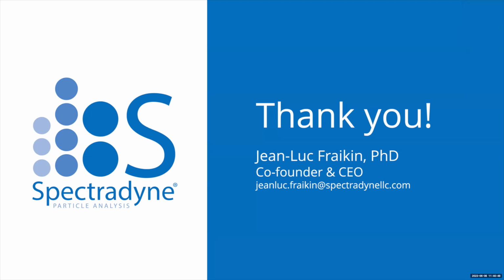Good. And then there was another question from Shiva. Hi, Shiva. She asks, how does this quantification compare with FFF-MALS based quantification or batch quantification with RiboGreen or other similar techniques? Kind of a two-part question. You want to take that?